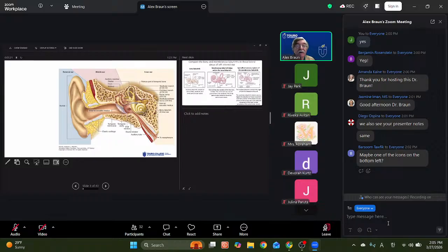Together, the secretions of the sebaceous gland and of the apocrine sweat gland, which is the ceruminous gland, along with desquamated epidermal cells, form earwax, cerumen, which you don't see in this picture, thankfully.